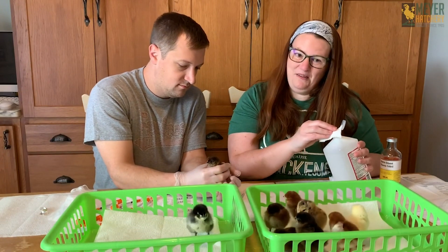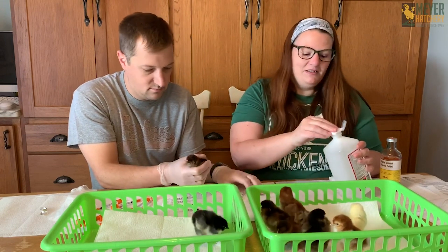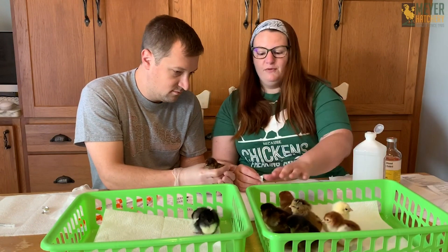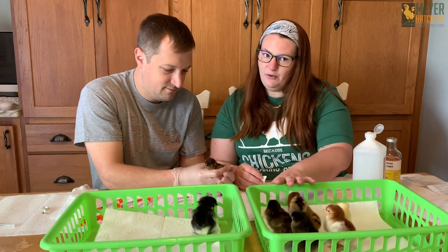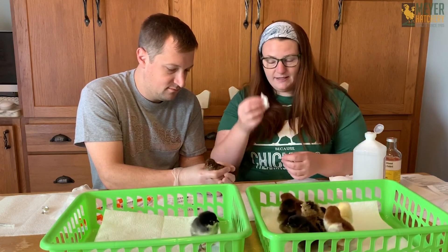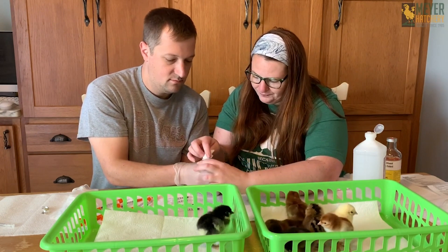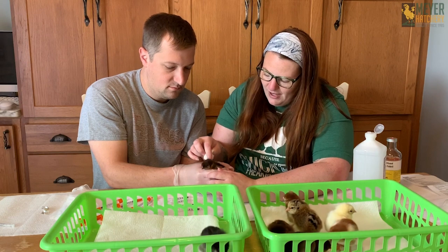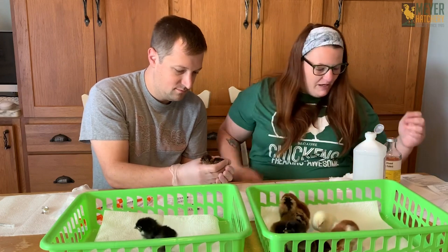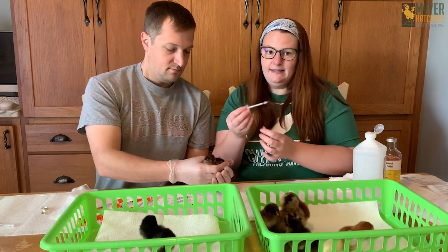All right, it's time to get started. I'm not going to lie, I am a little bit nervous — I did practice with one chick beforehand. The first thing you need to do when you have your chicks is make sure you don't double vaccinate. We've got two baskets set up: one with chicks who have not received their vaccination yet, and one with chicks who have. We're going to clean the back of the neck with some alcohol first. Just to note, you will be vaccinating your chicks with 0.2 cc's of vaccine.